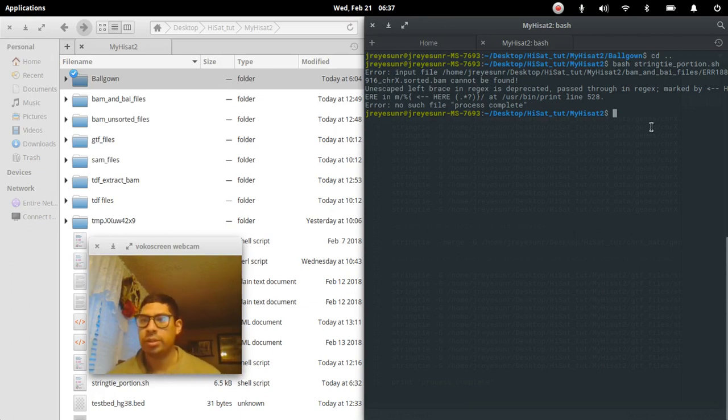So I've named one of these files incorrectly. Let's see what we've got to do.